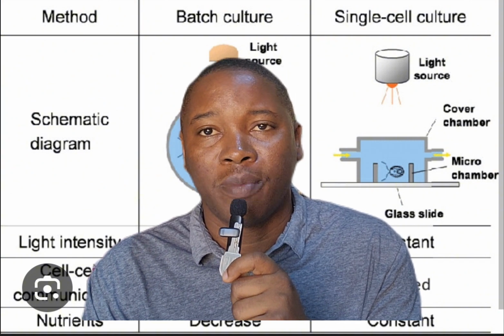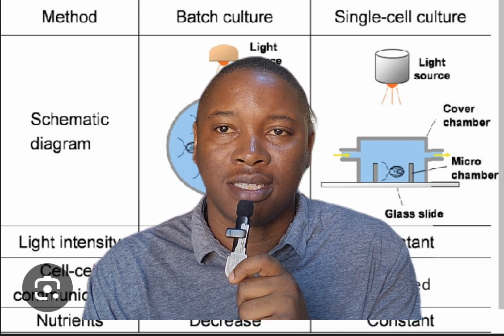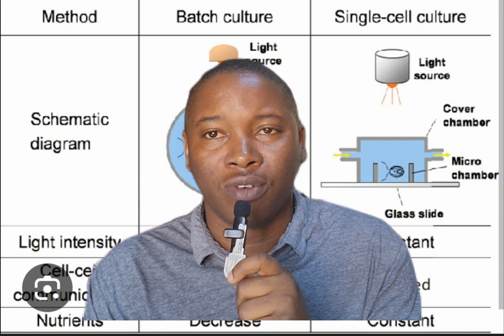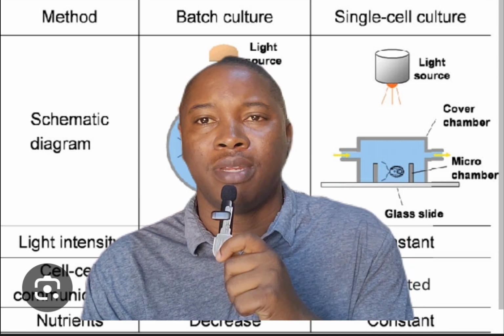Now we try to observe microbial growth. There are quite a number of ways. You can look at optical density, look at turbidity, or simply look at viable growth of microorganisms, viable cultures. So you just, with your naked eye, look at your media, examine your media closely.